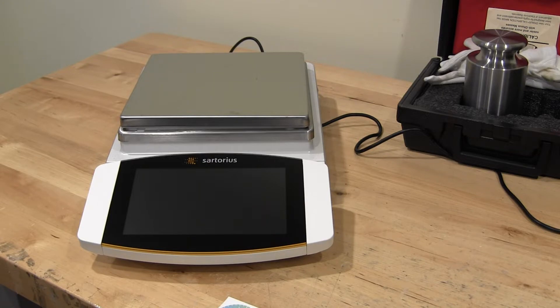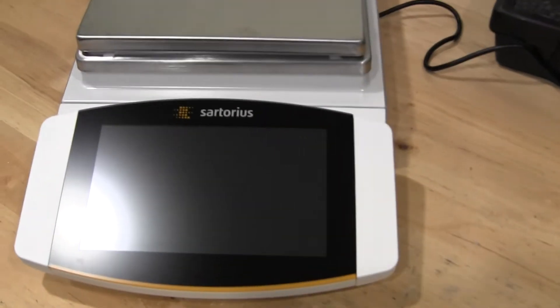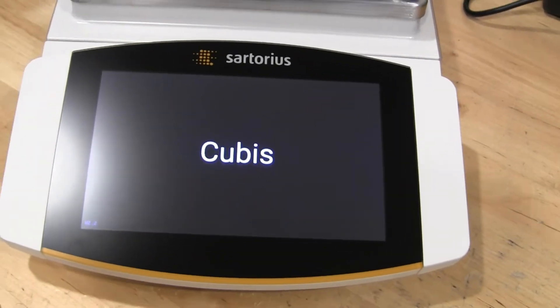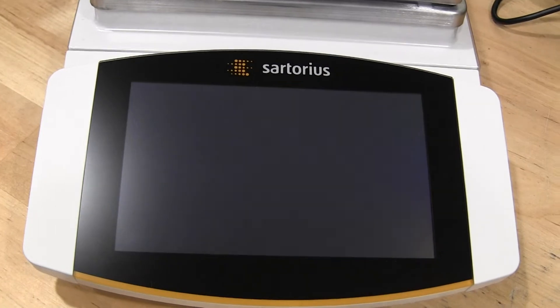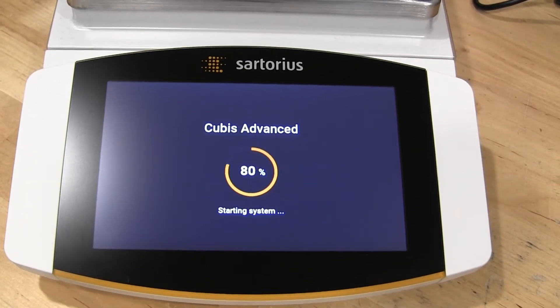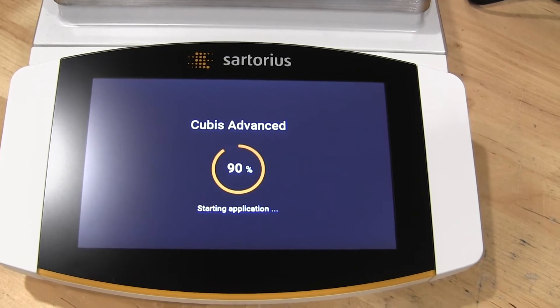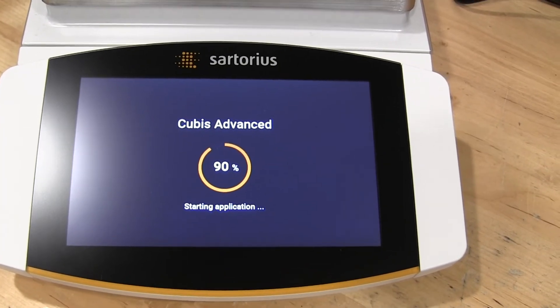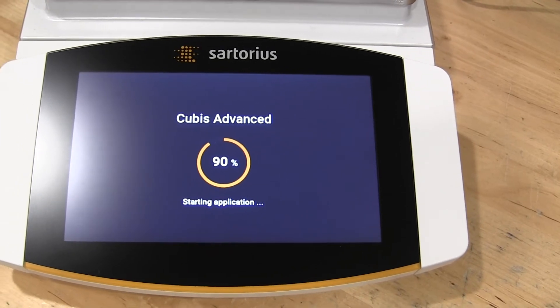I've already connected the AC adapter and the balance starts to power up. You'll see it says Cubis — Cubis Advanced. This is an extremely advanced balance, basically focused for the pharma industry.